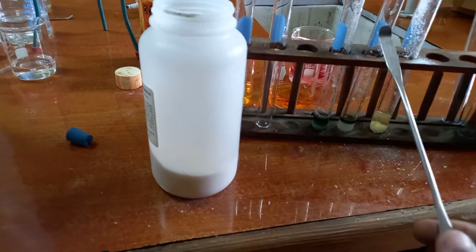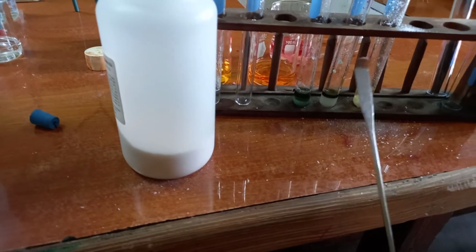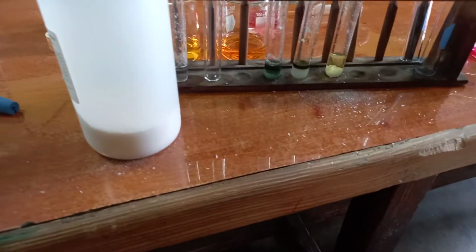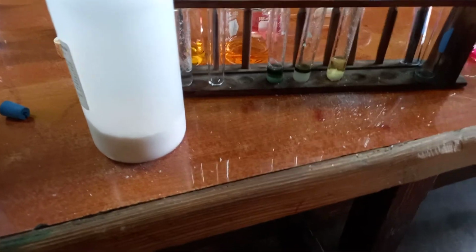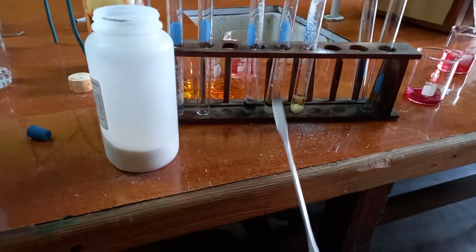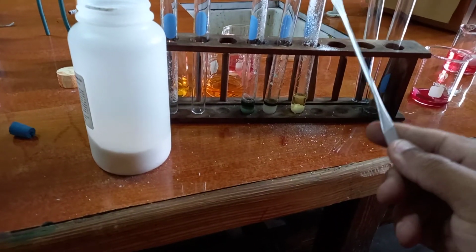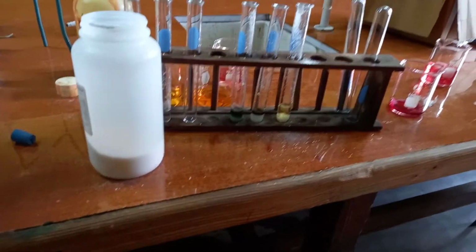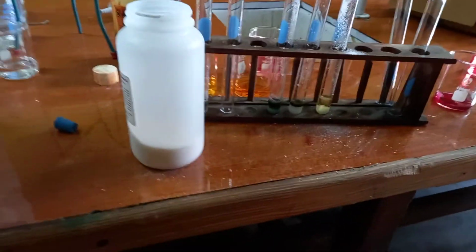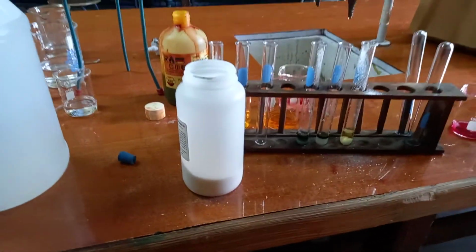So we can confirm that our ethanol was converted to ethanal, the aldehyde, and further oxidized to the carboxylic acid when we added the potassium permanganate, and we proved it, right? So we compared the reactions between a known aldehyde and a known carboxylic acid, and this is our sample in the middle. All right, so that's it for this video.